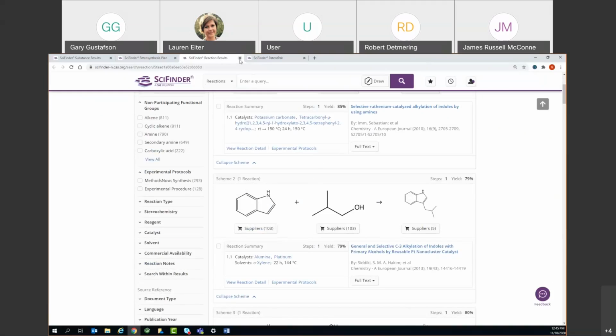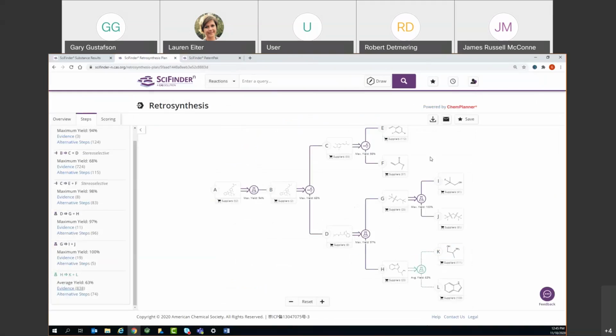So, all right. That's the retrosynthesis scheme, and I've shown you how to use that to make a known compound. The question always comes up, can we use this to do unknown compounds? Let me very quickly go through an example where that is the case.